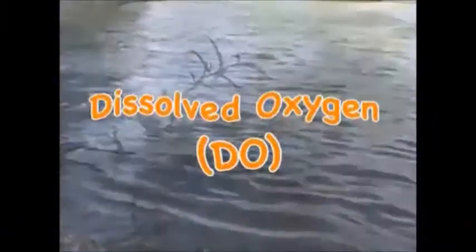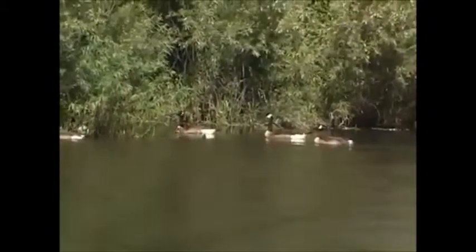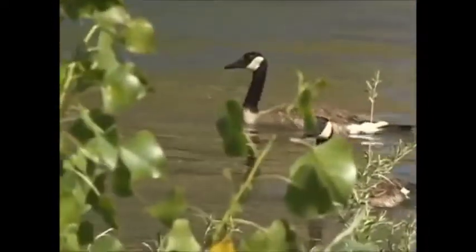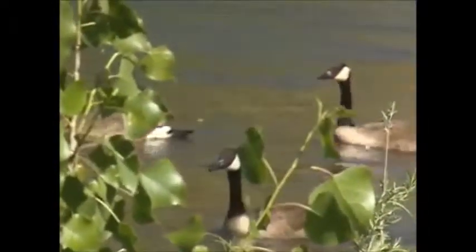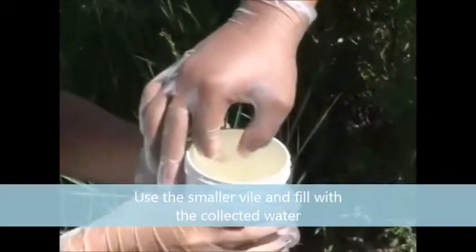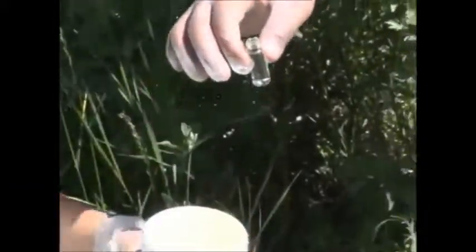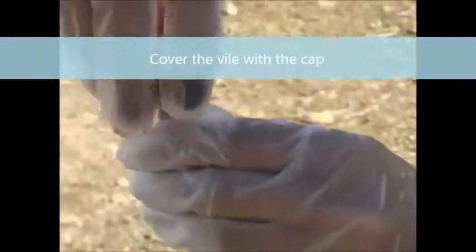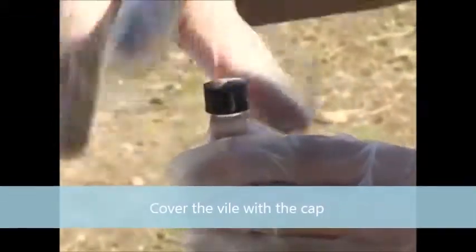The next test, dissolved oxygen or DO, is related to temperature, since cold water holds more oxygen needed for aquatic life to survive. Low or fluctuating DO levels can harm the aquatic life. Using the smaller vial, fill it with water all the way to the top so there is no air left in it. Drop 2 dissolved oxygen tablets from the blister pack marked DO into the test kit and screw on the cap. If your vial is filled properly, some water will overflow as you do this.